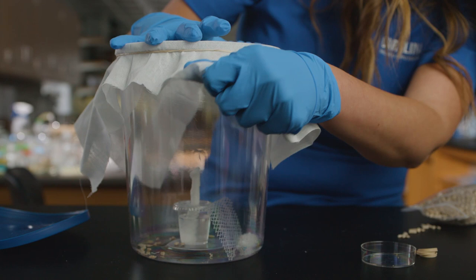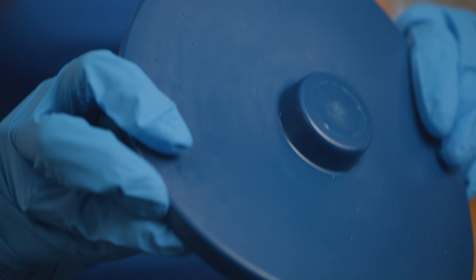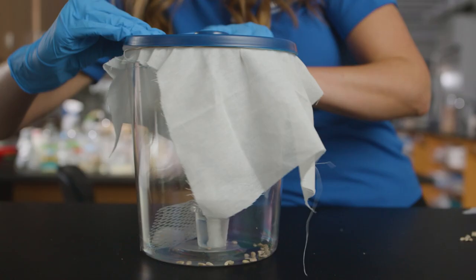Check for folds in the cloth where nymphs could escape. Use a lid with tiny perforations or loosely place the lid on the culture jar to be certain that air exchange can occur.